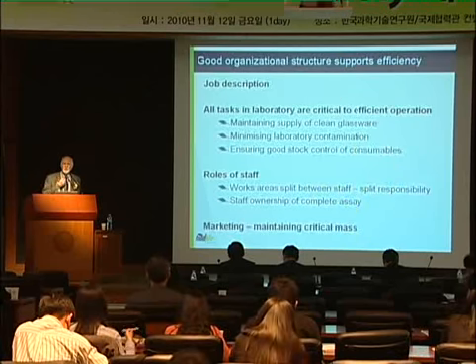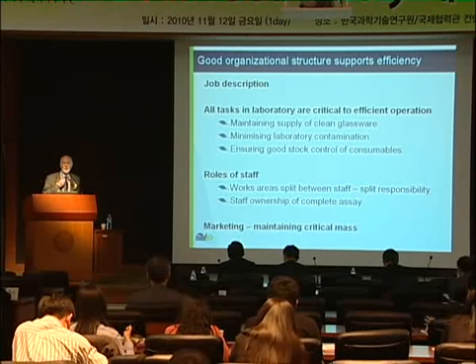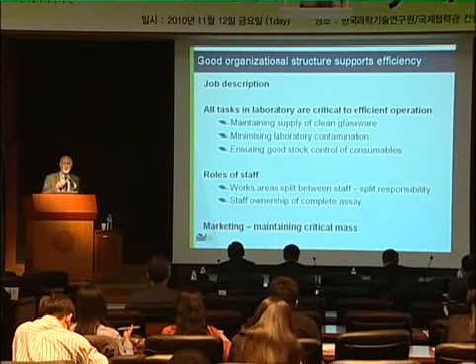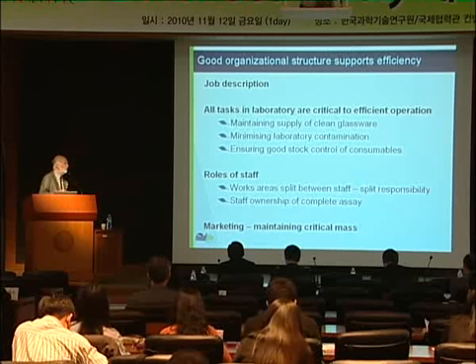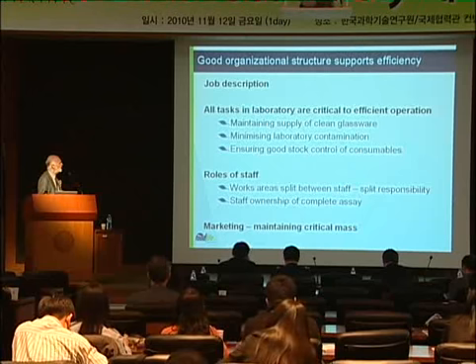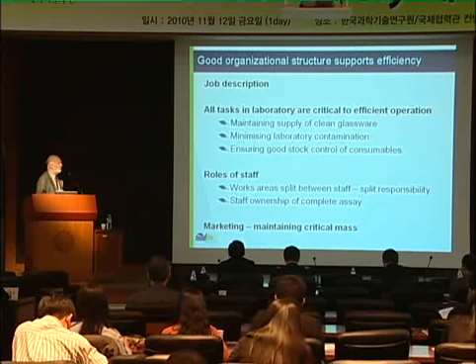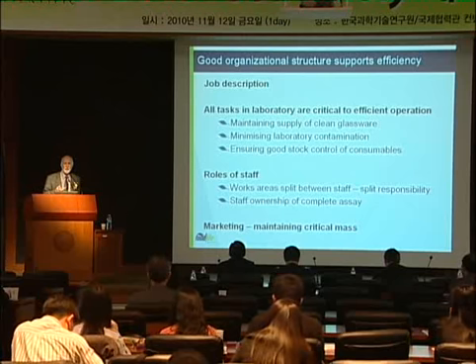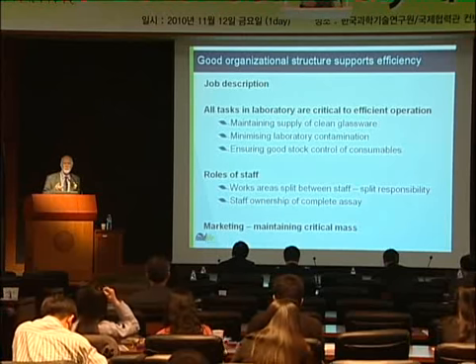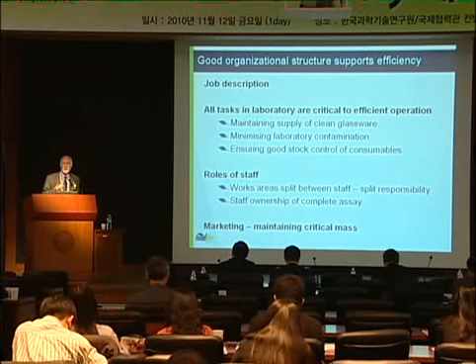Many things are important in effectively running the laboratory. I put this slide together just to demonstrate that sometimes very simple and obvious things can have a big impact on profitability and efficiency. If staff responsible for cleaning the laboratory and glassware do not carry out their jobs effectively, you can introduce contamination to the laboratory, which can sometimes take some months to clear.